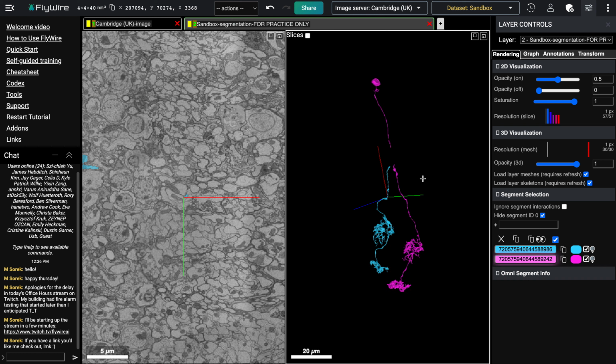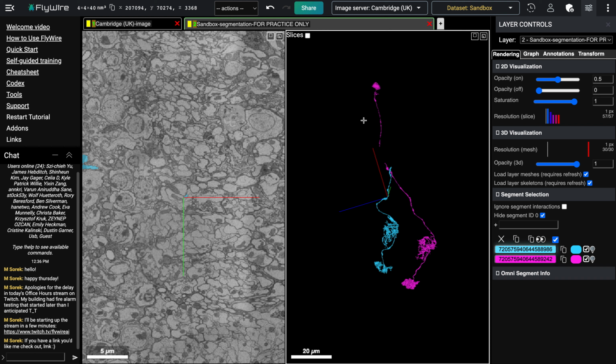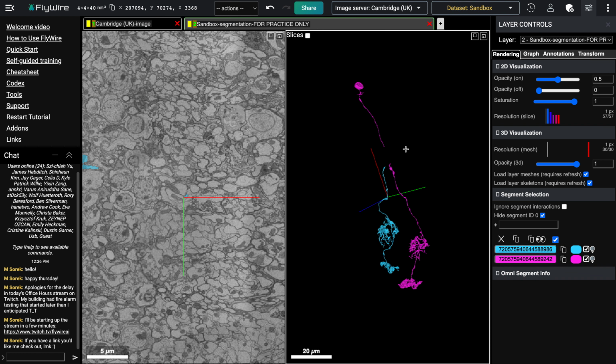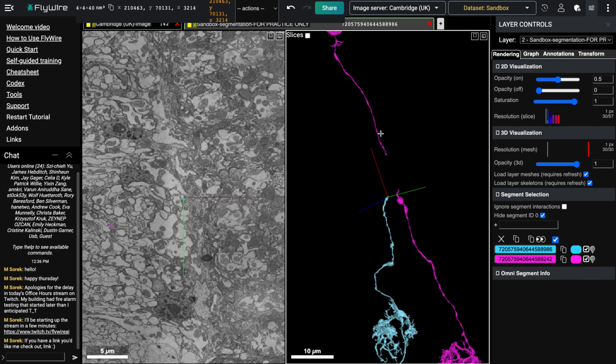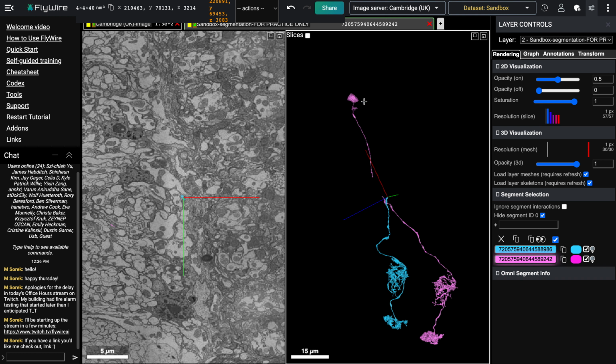So this is an L5 monopolar cell, and I found this other one, so I kind of know what I'm going to be looking for in the area, and since someone's already completed this, I know what kind of structure I'm going to be looking for and vaguely where it's going to terminate in the data set.